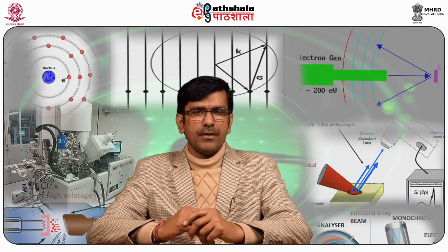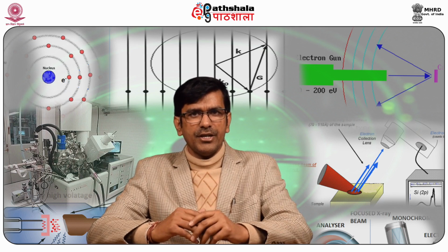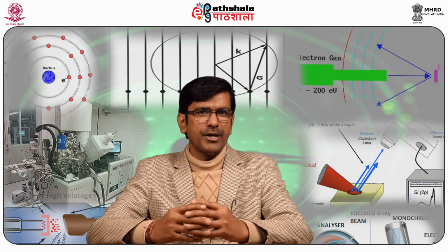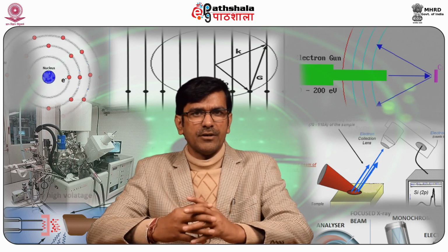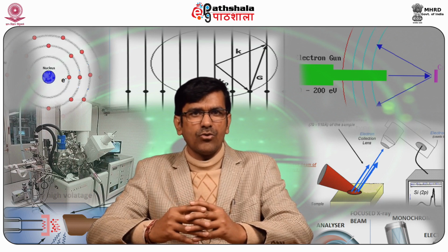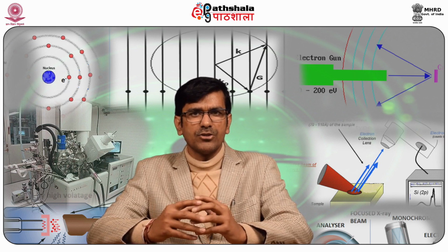Next is the data analysis. Most electron spectrometers use online computers for operating and data collection. It is also desirable to correct the data for background, distortion of collection efficiency as a function of electron energy, and contributions from satellite X-rays if a monochromator is not employed. Finally, it is most valuable to deconvolute the spectral data. The major problems that beset the deconvolution are knowledge of the line shapes and the background, which are often quite difficult to ascertain with precision. Nevertheless, deconvolution is a necessary element of data analysis, particularly in X-ray photoelectron spectroscopy.